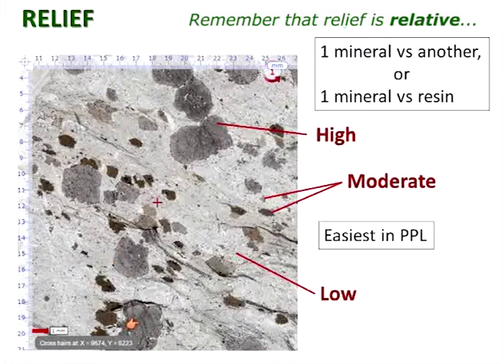And that has a similar appearance, a mottled grey appearance across the slide. So that might be one mineral you can identify, and I imagine most of you could identify that, particularly if I told you that it goes black under cross-polarized light.